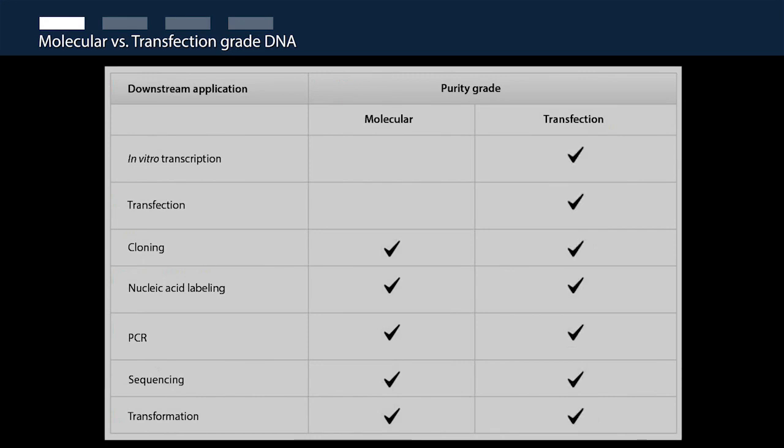Transfection-grade plasmid DNA may be used for all applications, from in vitro transcription to transformation. This video will demonstrate the preparation of molecular-grade plasmid DNA.